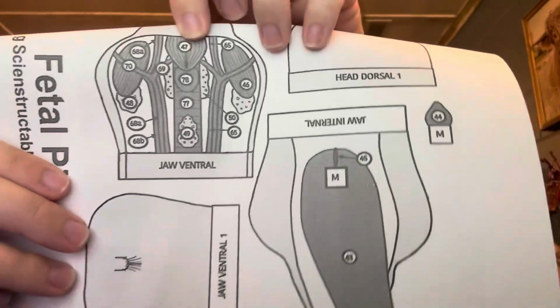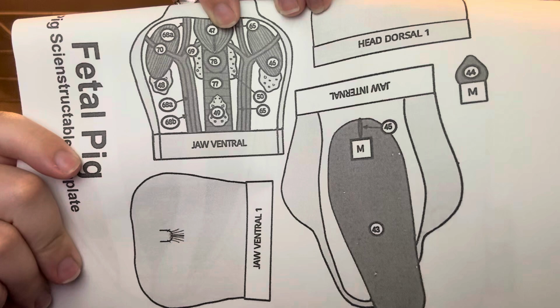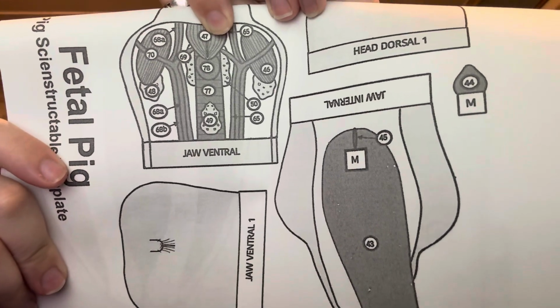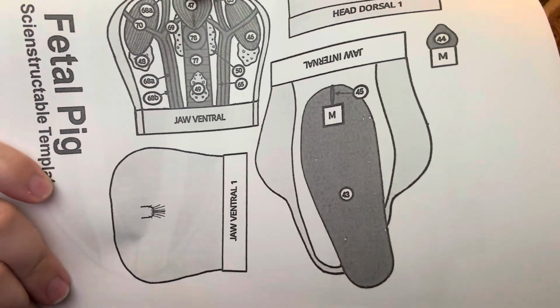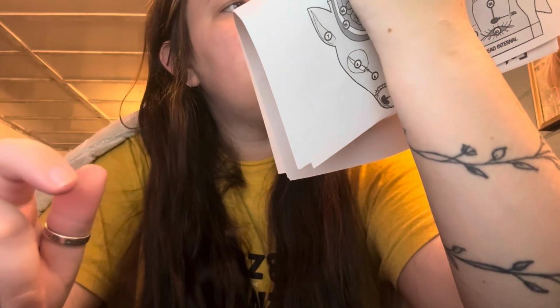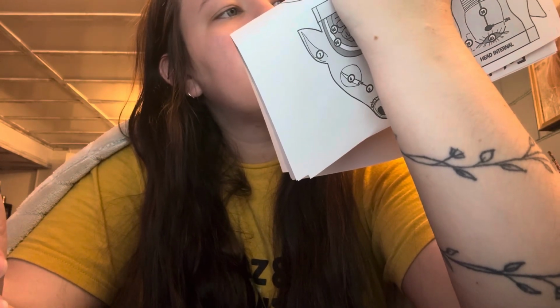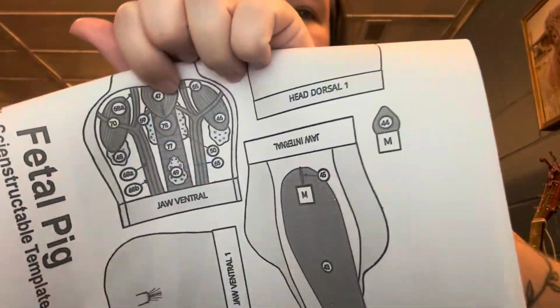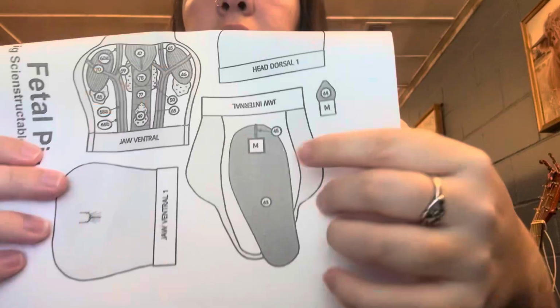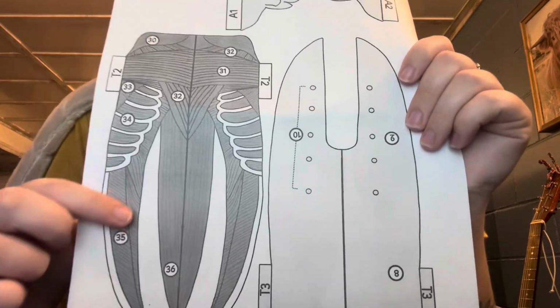This will have the thyroid gland, thymus gland, the mylohyoid, the parotid glands, the internal jugular vein, the external jugular vein, the transverse jugular vein, the external maxillary vein, the trachea, and the larynx. This here has the tongue and the epiglottis. Okay.